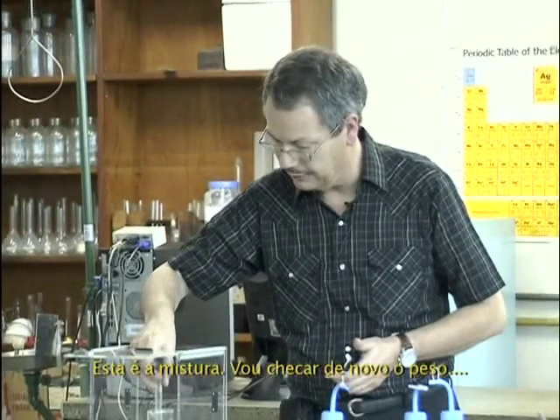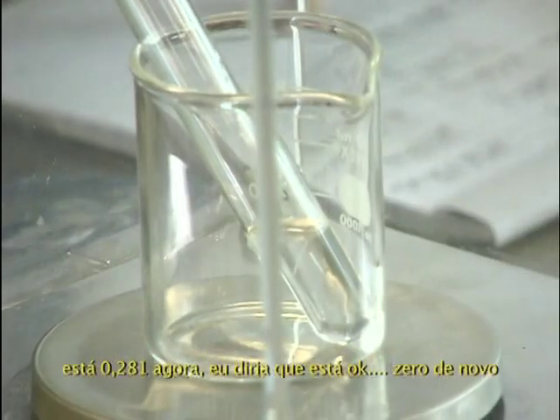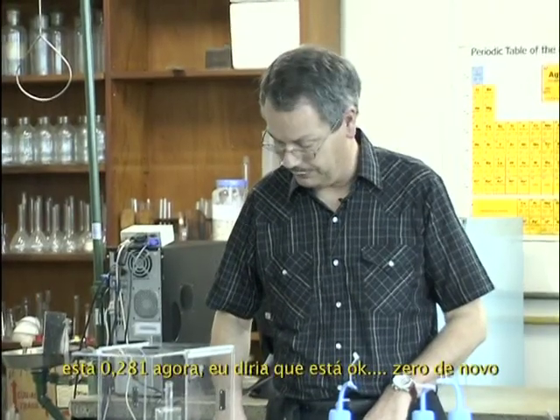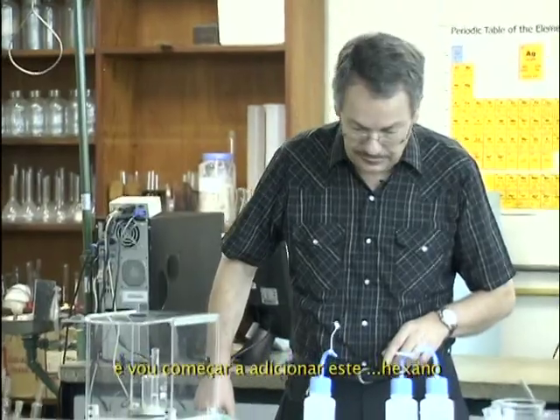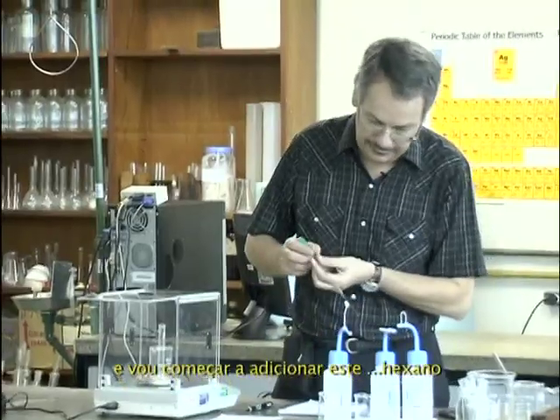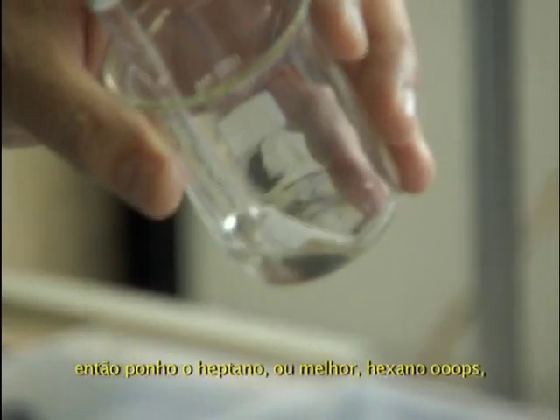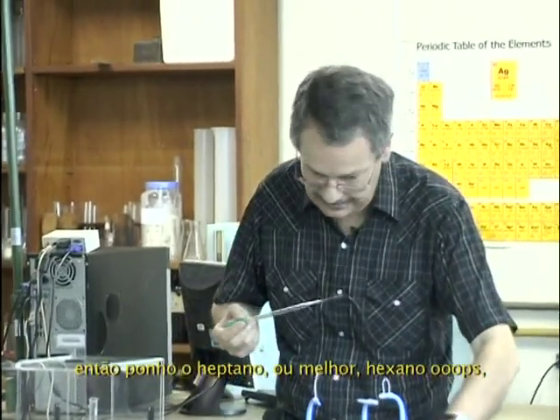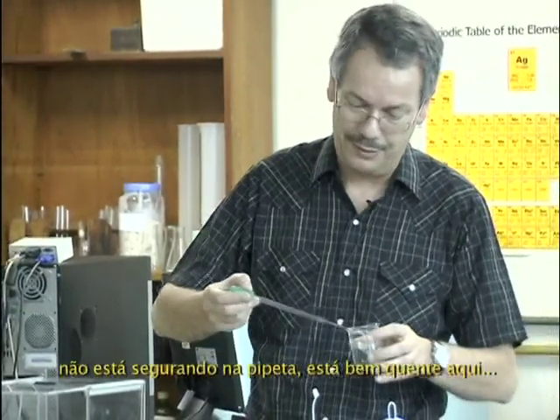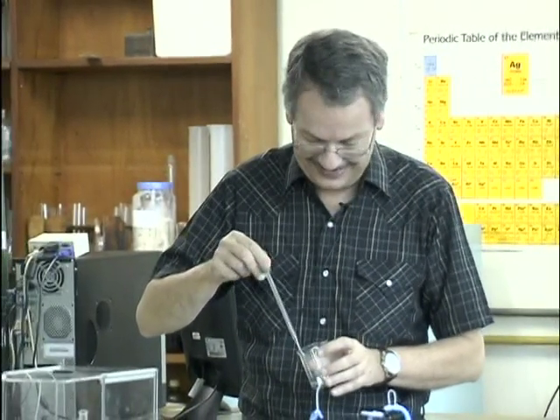I will check again the weight. So that's 0.281 now. I say it's okay. Put 0 to have the reference value. And I will start to add, which one is it? This one, hexane. So I take hexane, oops. It doesn't stay, it's very warm here. It doesn't stay in the pipette. I'm glad nobody got it.